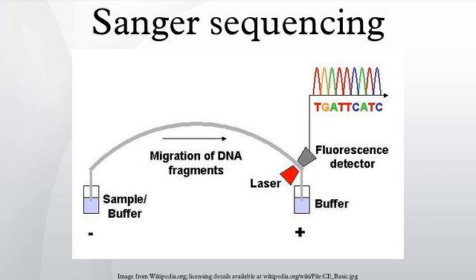Limitations include non-specific binding of the primer to the DNA, affecting accurate readout of the DNA sequence, and DNA secondary structures affecting the fidelity of the sequence. Dye-terminator sequencing. Dye-terminator sequencing utilizes labeling of the chain terminator ddNTPs, which permits sequencing in a single reaction, rather than 4 reactions as in the labeled primer method.